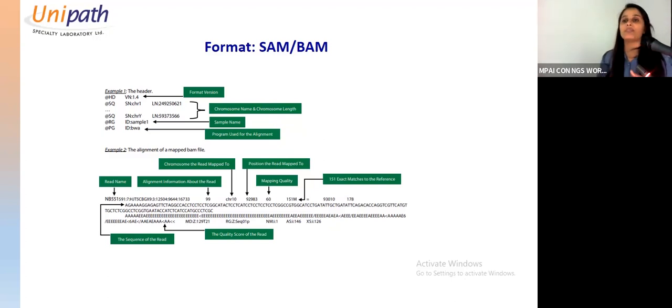Okay, if it is mapped, but whether it is able to map confidently. So if quality is 60, like 60 is good quality, it's mapped with good confidence. So this is mapped in a proper way. But if it is 0, then you can say that it is multi-mapping. Multi-mapping means it's not confident. It is mapping to this particular part of the reference genome, and it is also mapping to another part of the reference genome. So that is less confident. Right? So this is a basic overview of the BAM file.